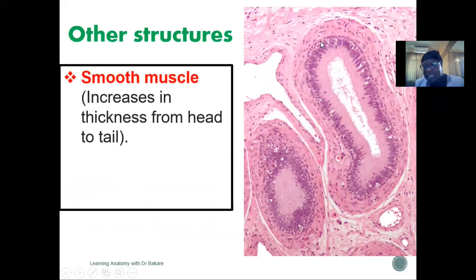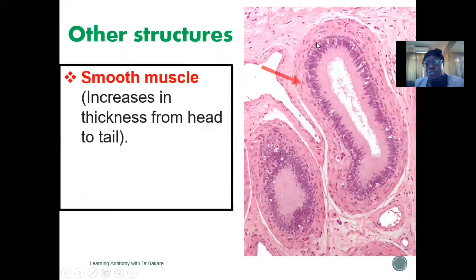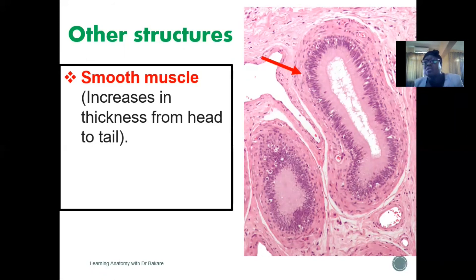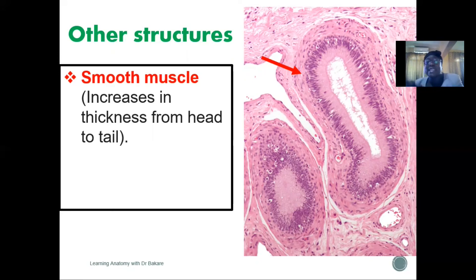Other structures seen within the histological section include the smooth muscle layer. After the epithelium lining, the next structure is the very thin lamina propria, followed by a smooth muscular layer. This smooth muscle tends to increase in thickness as you go down the epididymis. In the tail region, it increases so as to enhance peristaltic movement, pushing the sperm out of the epididymis into the vas deferens to continue further in their journey.